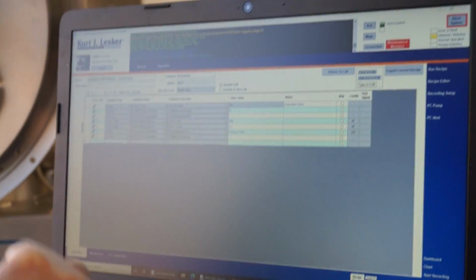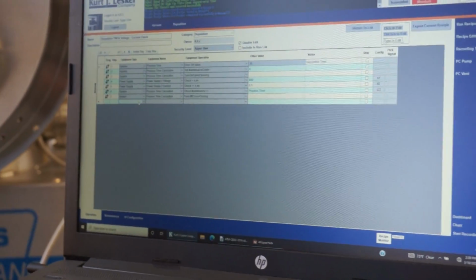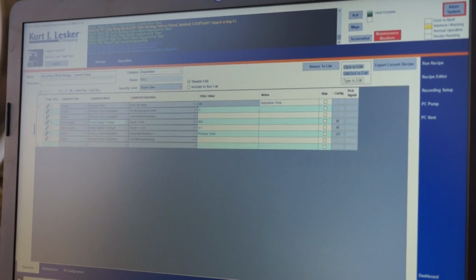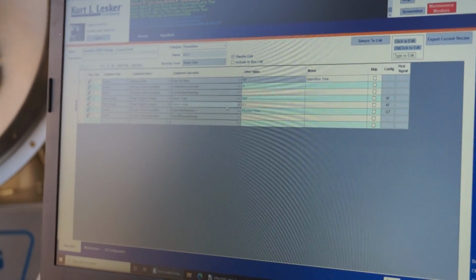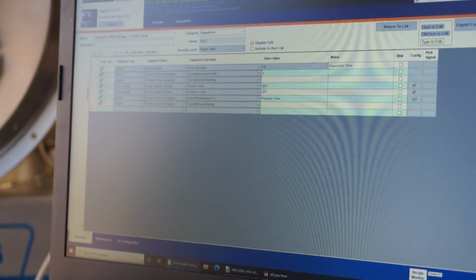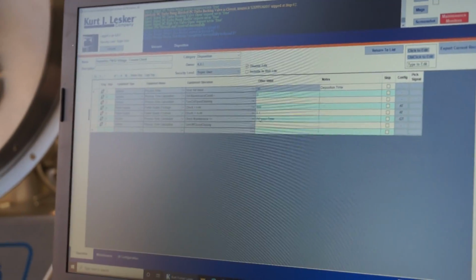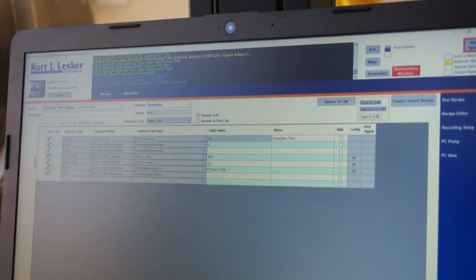You first turn the power supply on, power supply 2. So we're looking to make sure the system's not open, and it's not shorted. So for this here, here's a check step before you run. Check that the voltage is less than 800. If it's open, you're not going to get a plasma. If it's shorted, you know. So we're checking this between these values. And if it's between these values, we're going to go ahead and run.